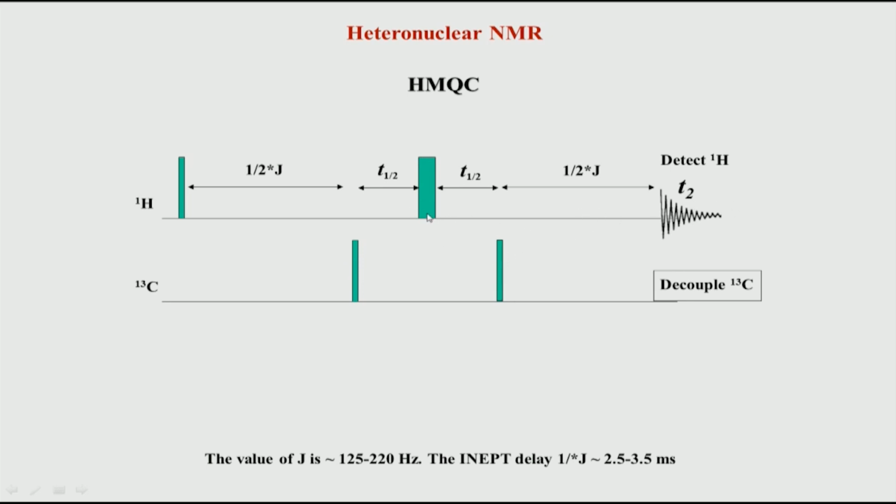Typically in NMR, the 180 degree pulses are not very efficient as compared to the 90 degree pulse. So, 180 degree pulses are very bad in terms of efficiency, and therefore, one of the areas of research in NMR is how to design a very good 180 degree pulse. There are several papers published over the years on just an inversion pulse or a good refocusing pulse.